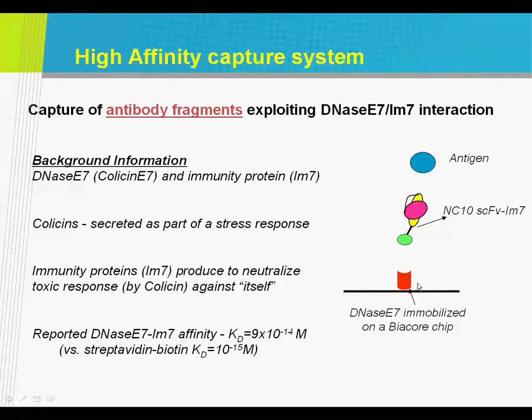So for that, we first had to make the DNase E7. This slide just shows the method, how it's made, and this is well documented in the literature. So all we did was get it out of the literature, made it, and it worked really well.